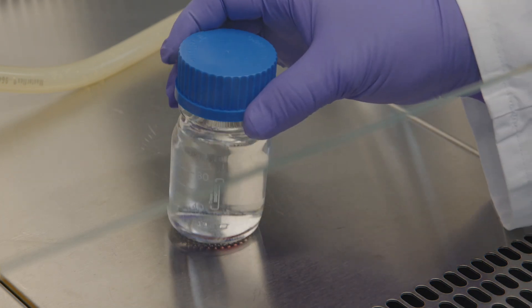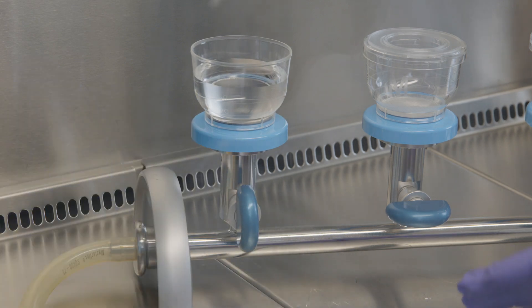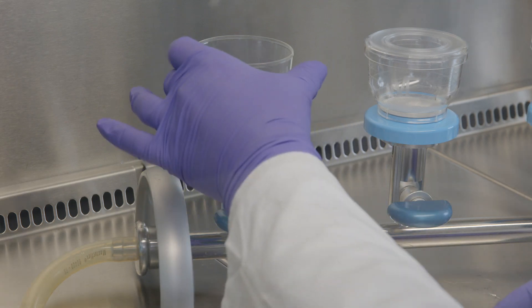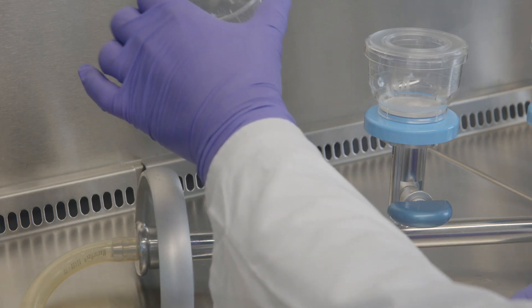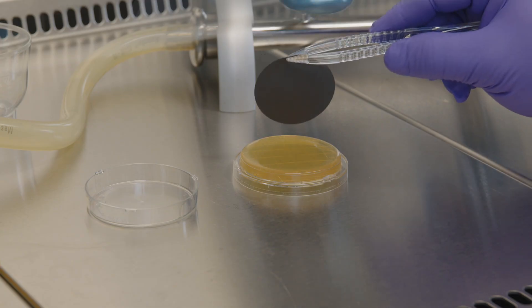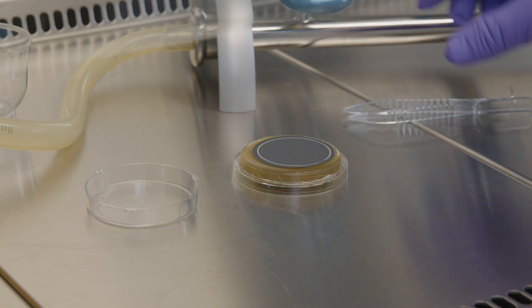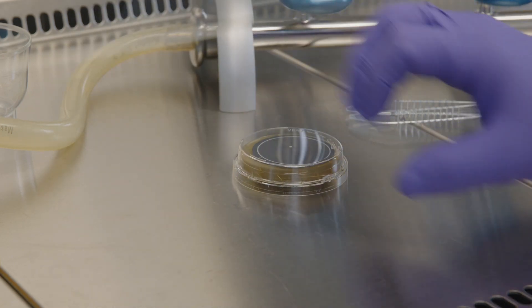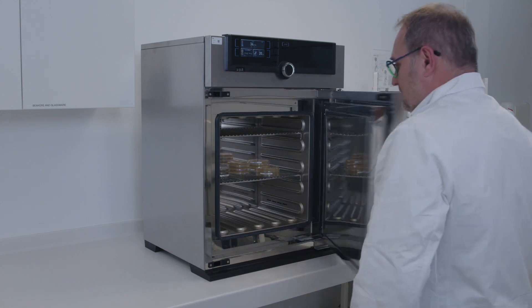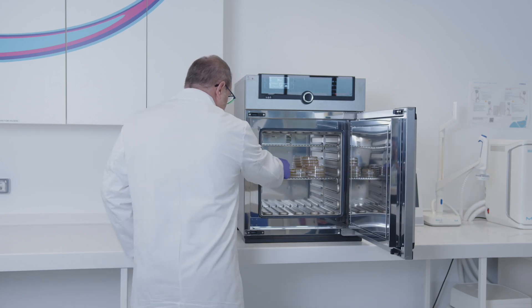Shake gently again. Filter the liquid through a membrane filter. Once completed, remove the funnel of the filtration unit. Then carefully remove the membrane with forceps and place it on an agar plate. Incubate the plate according to the guideline. Take the plate out of the incubator and count the colonies.